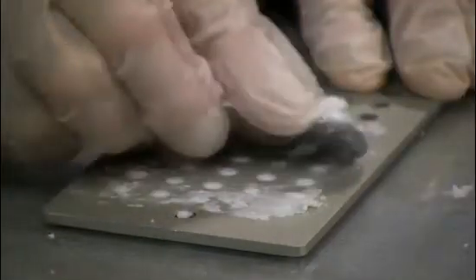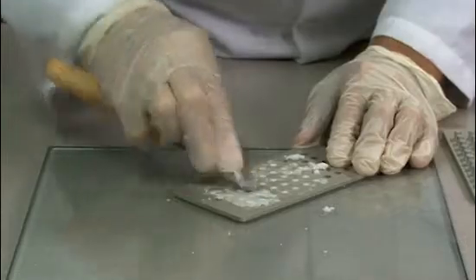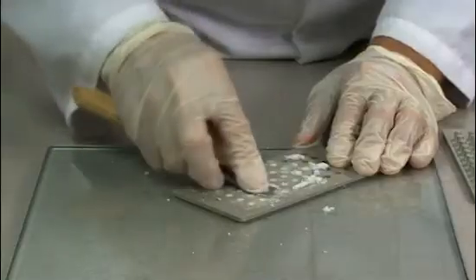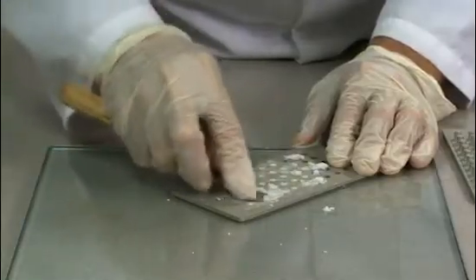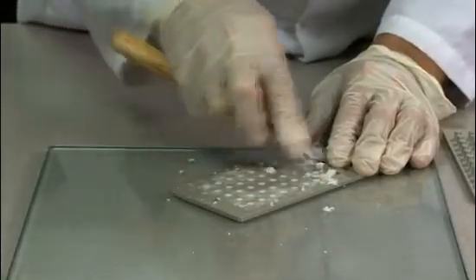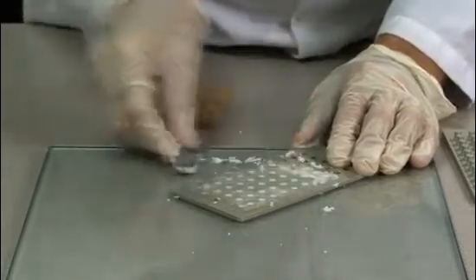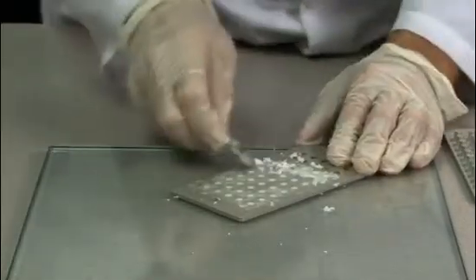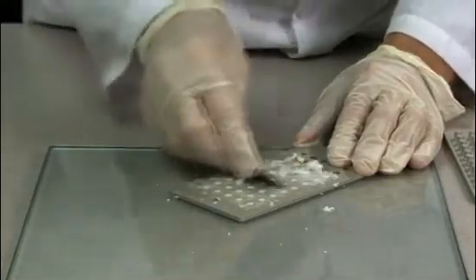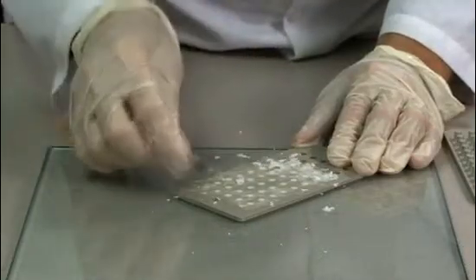Again, do not worry about filling the entire mold if you start to run out of material. But be sure whatever you fill is packed tightly. You will notice as time goes by, the powder becomes more flaky, becomes more difficult to work with, and that's simply because the alcohol in the wetting solution is evaporating.